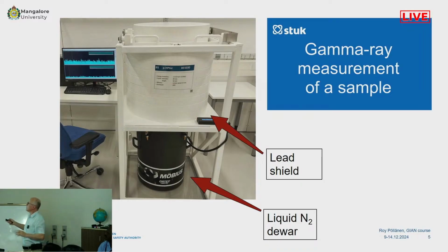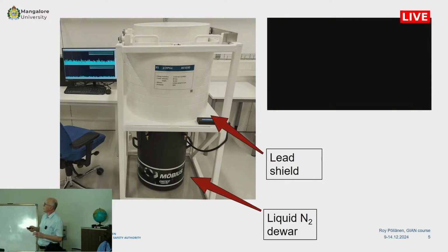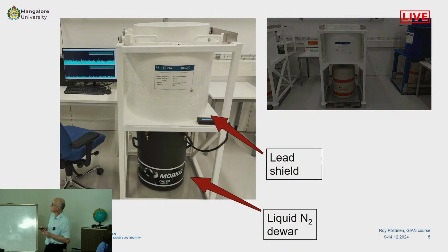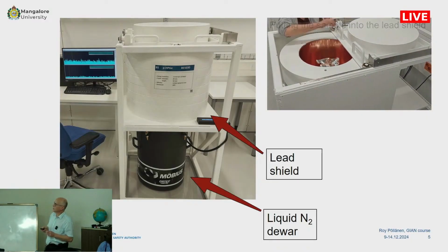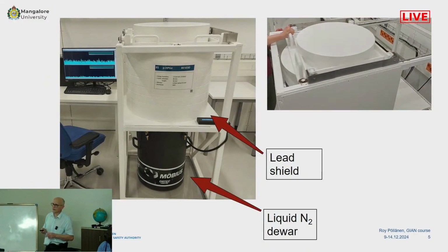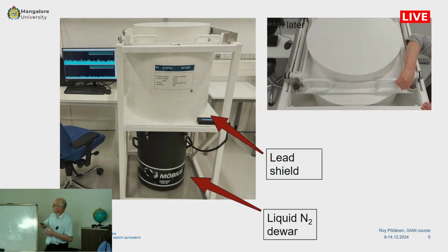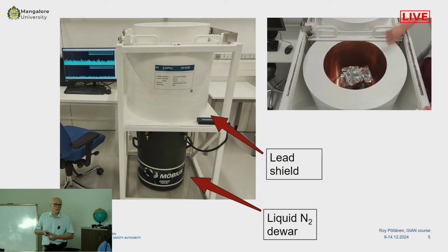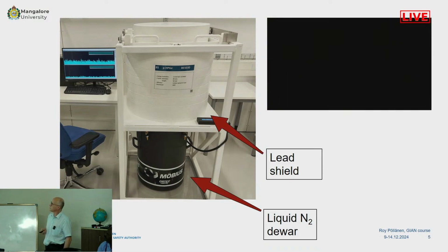Let's look at what happens here. So this is one of our samples. I will explain later. Putting the sample is a very, very simple thing. There is no complex process. After measurement, 1 day, for example, the sample is taken out.